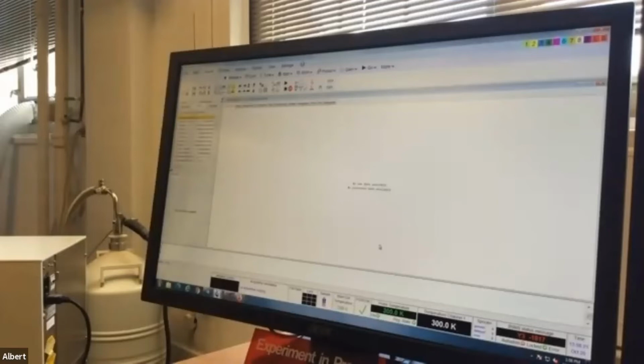So this is very sophisticated, right? Now you want to click tune. Just click the button itself, the tune button, not the menu button, because there are other commands that come up, but you don't need them. Once you click tune, you'll see down at the bottom left what it's doing. And then on the screen, you're going to see a parabola come up. That's the tuning. Now that's done. Once you see that, it's finished. That's tuning the probe to your proton sample.